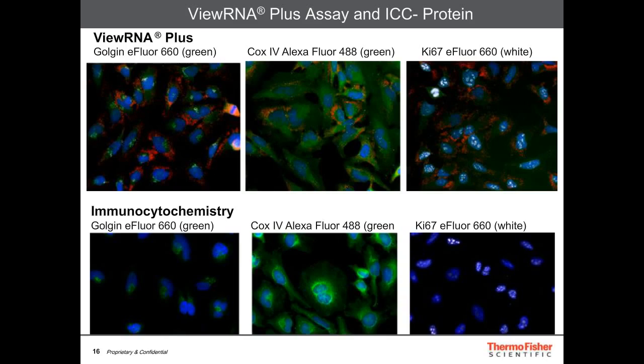But I point it out because there can be some differences when you're combining two assays, one for looking at protein and one for looking at RNA, that you may not get exactly the same performance as you would with immunocytochemistry, where you're just looking at protein levels.